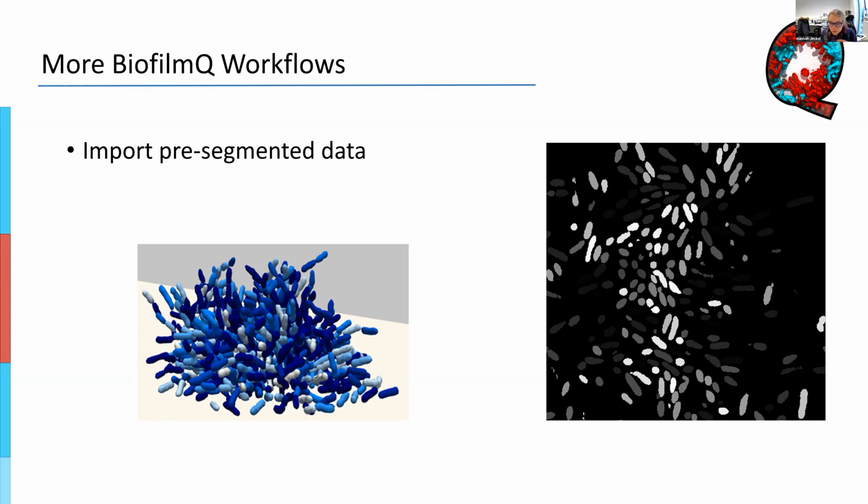There are amazing tools out there that can segment your data. There are amazing neural network architectures that you can use, and people are really putting a lot of effort into making them available also at this conference. I'm sure you have checked it out. Deep learning is becoming more and more popular and is taking over this field of segmentation with classical image analysis.